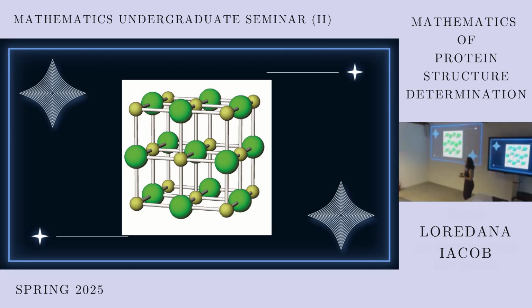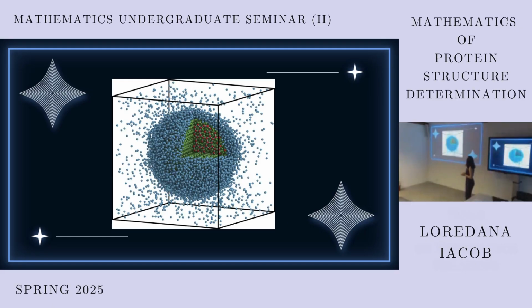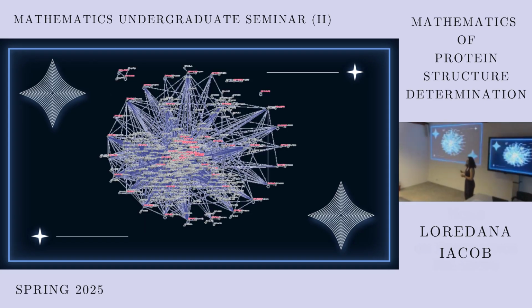not all crystals look like this. Here, it's perfect. Everything is perfect. You just clarify, you know where everything is. But real crystals look like this, or like this. And as we're talking about proteins, it can even look like this. This is a huge mess. We don't like this mess.